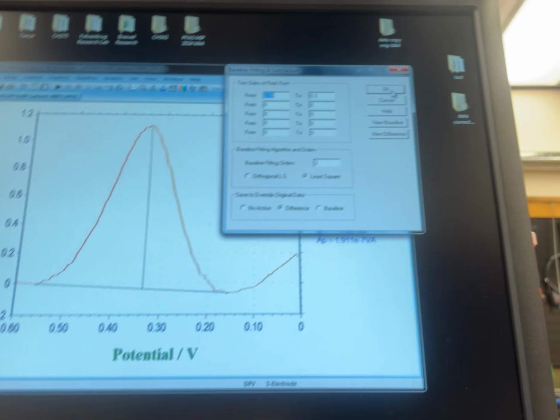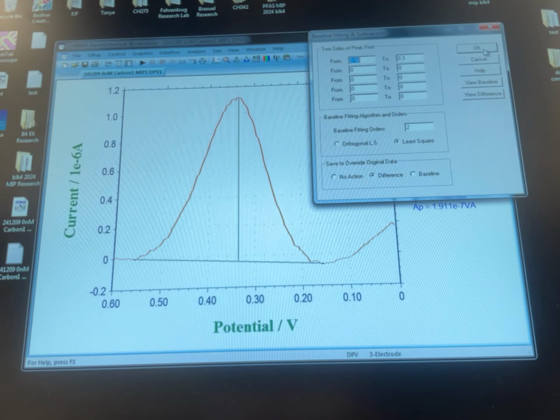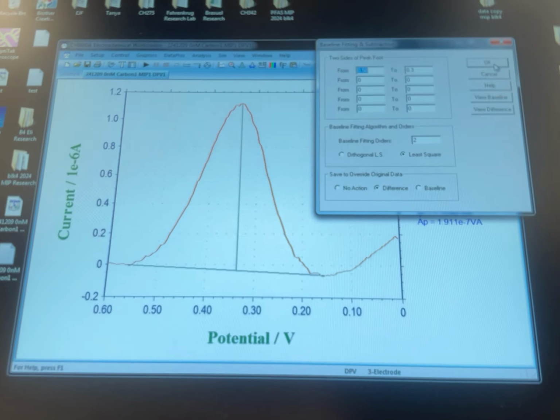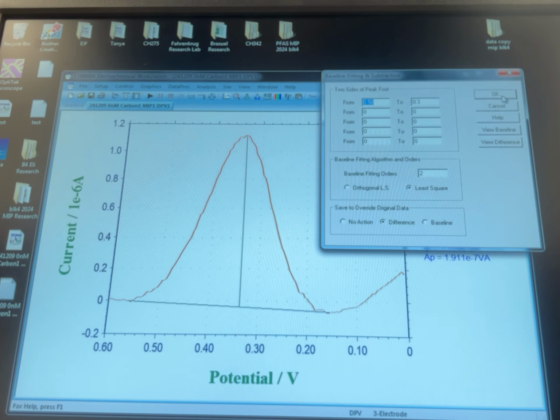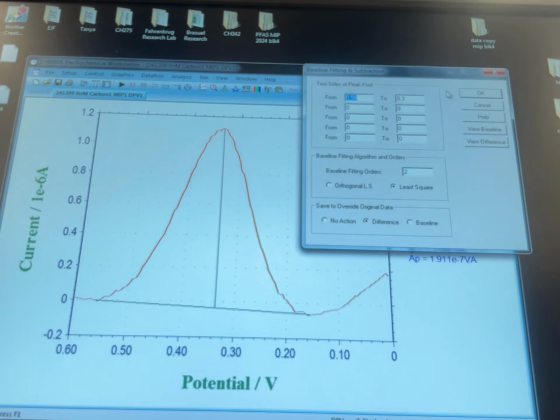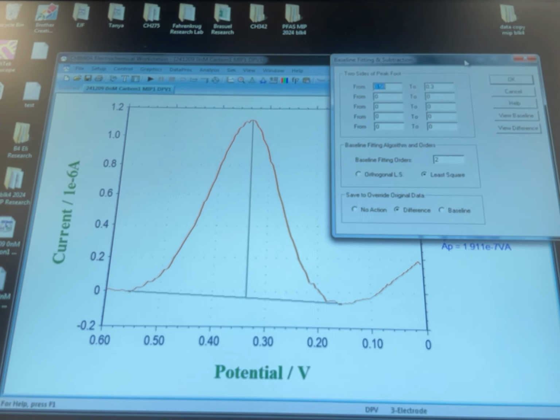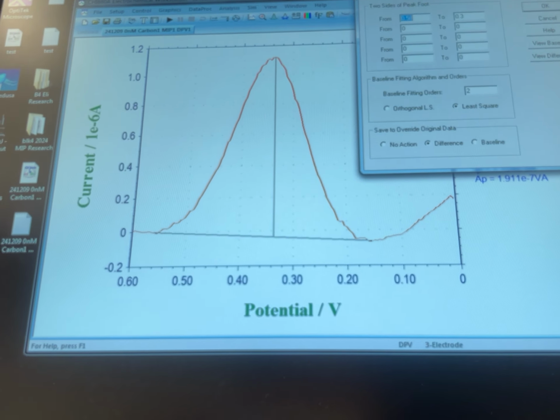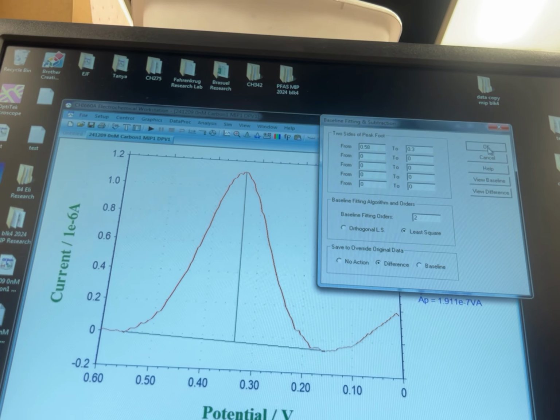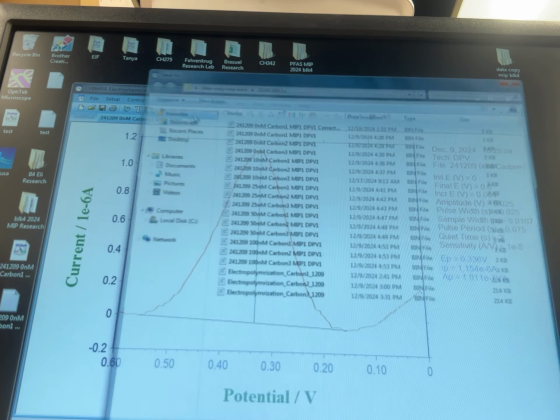If we want it, we could click OK, but please do the adjustment before you click OK, because clicking OK will save the document, and then you cannot change it, or if you pull up the raw data again. But if you want it, please remember to click OK, or it will just save the raw data for us, even as another document. So I will click OK to save it, and File and Save As.